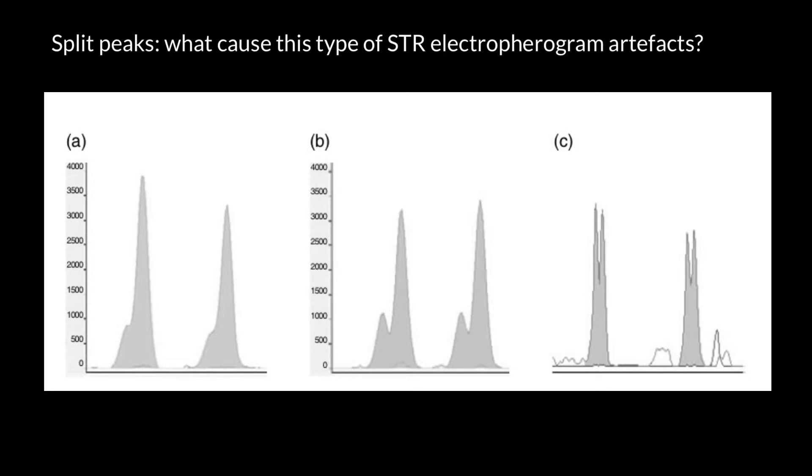Hello and welcome to Nikolai's Genetics Lessons. This video is part of my Forensic Science and Genetics playlist, and in this video I'm going to talk about split peaks — what causes this type of STR electropherogram artifact. If you look at picture A, you can see that each peak actually consists of two peaks, and on picture C we see split peaks that are about the same size. So how do we analyze such electropherograms, and what causes these split peaks?